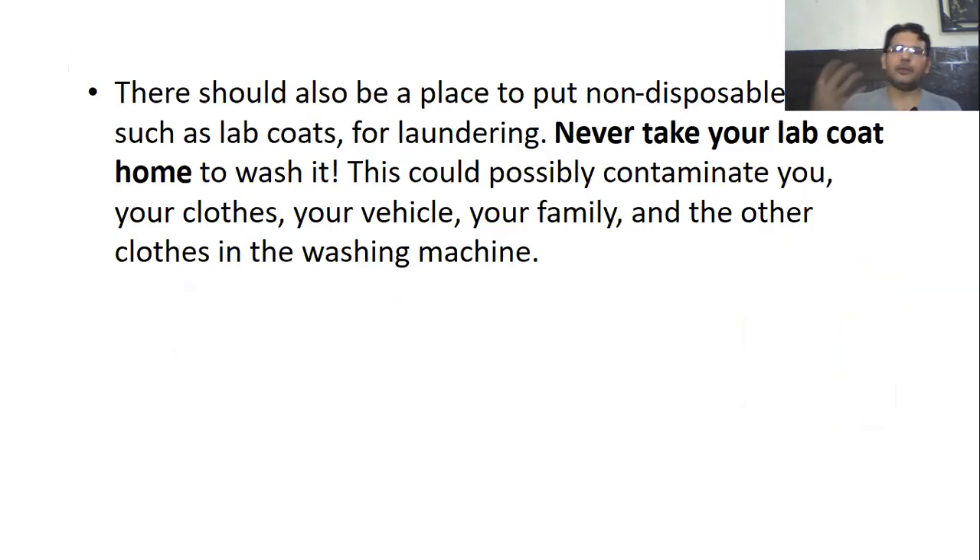After completing the work, you should remove all your disposable personal protective equipment and put it into the trash bin. There is also a proper way to store contaminated PPEs and a way of disposal. There should also be a place to put non-disposable PPEs such as lab coats for laundering. Never take your lab coat home to wash it. In California and at the University of Alabama Birmingham, there were specific designated areas where we used to hang our lab coats — we'd write our name on them, put them in the designated area, and staff would wash them, clean them, and return them to a clean area.